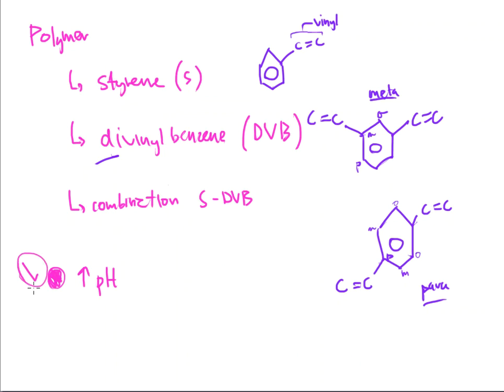That was the problem with silica, right? So if we're using NaOH or KOH as a mobile phase, it's not going to interfere with the particle. It's not going to dissolve them. It's not going to break them down. It's not going to destroy them. It's not going to make my column go nasty over the course of time. It's as simple as that. So styrene and DVB can do a very good job handling that alkali mobile phase that you might have to use in chromatography at some point in time.